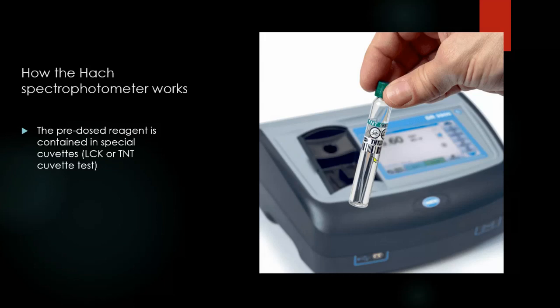Or sometimes there are other reagents, because maybe there is not only one reagent to measure one specific compound. But this is usually where the reaction happens. We have to put the sample inside the cuvette and then make it react with the reagent. The cuvettes are named LCK or TNT. It depends on the part of the world; you should have LCK.